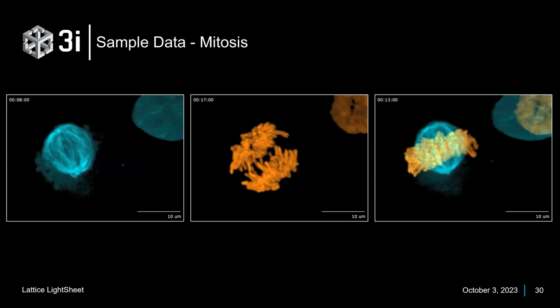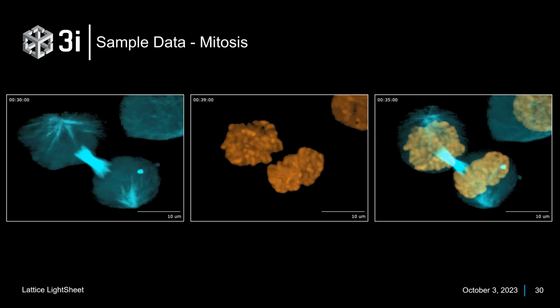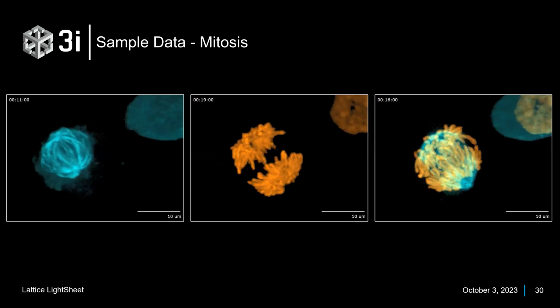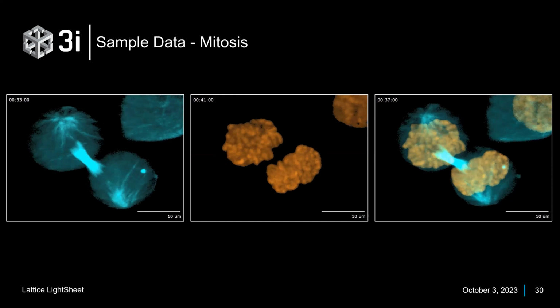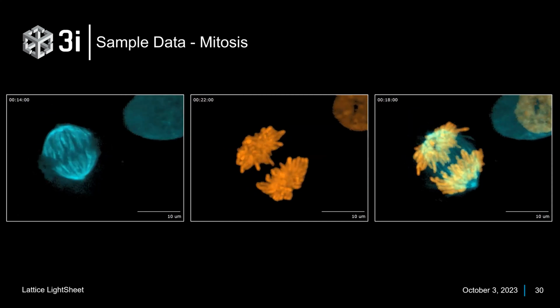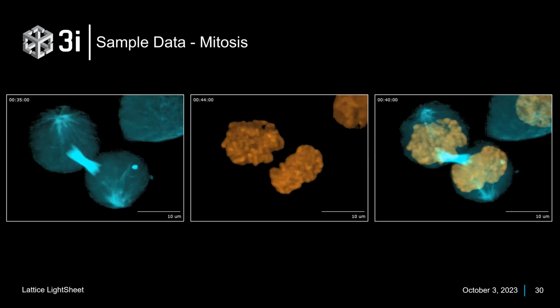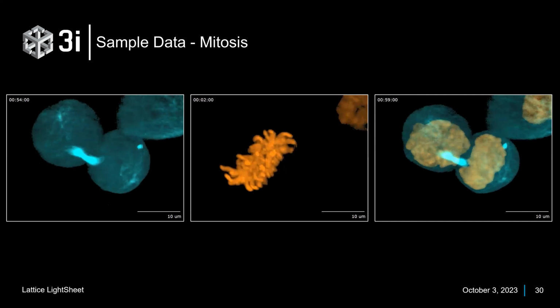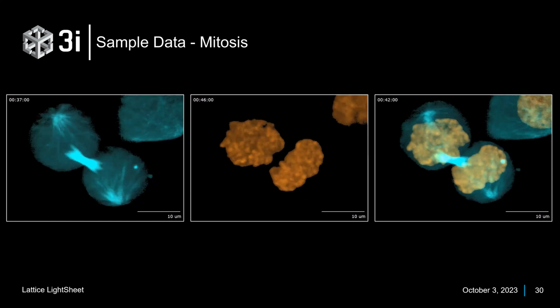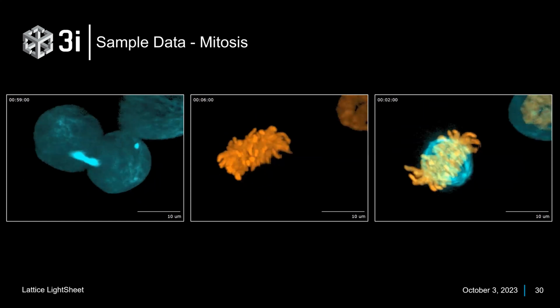The pair together is about $50,000. So it's way more expensive than what most people are used to objective-wise. They do break. And I get to have the uncomfortable conversation with people of, these are niche objectives. We usually have 1, maybe 2 spares in our office. But if they have to be repaired, we're talking a 4 to 5 month trip back to Nikon in Japan. They get the spa treatment and built from scratch again, but it takes a while.